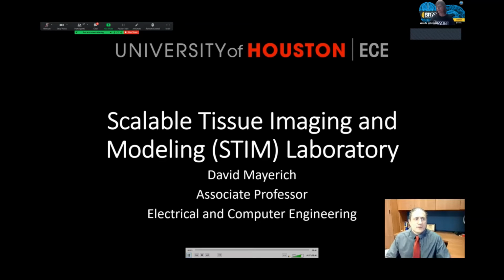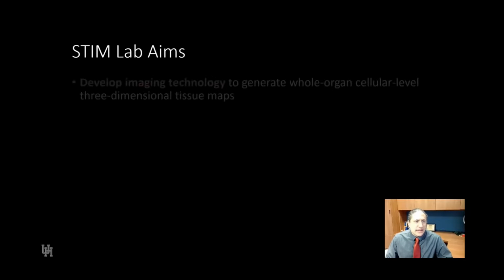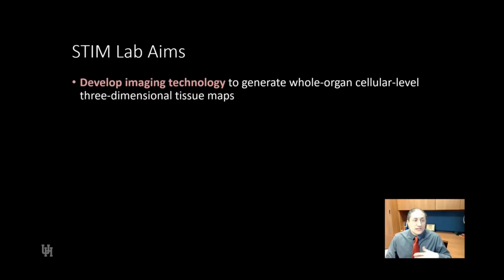My name is David Mayerich, and I'm an associate professor in electrical engineering at the University of Houston. I'm going to give you a brief presentation and tour of the Scalable Tissue Imaging and Modeling Lab here at UH. Our research focuses on the acquisition and data mining of tissue images at scale, enabling the generation of whole organ, cellular level tissue maps.